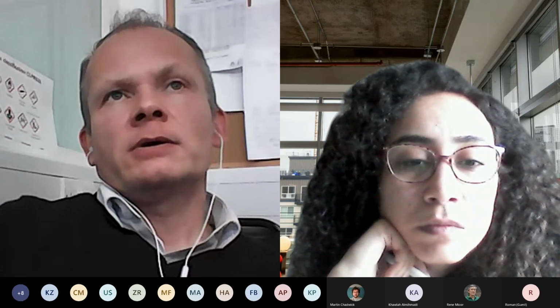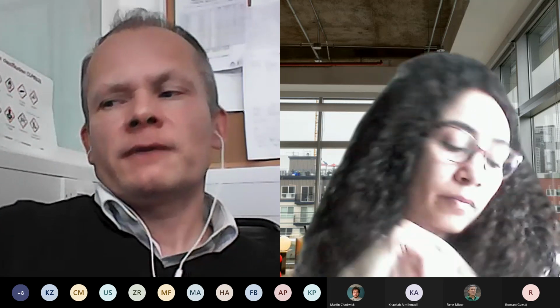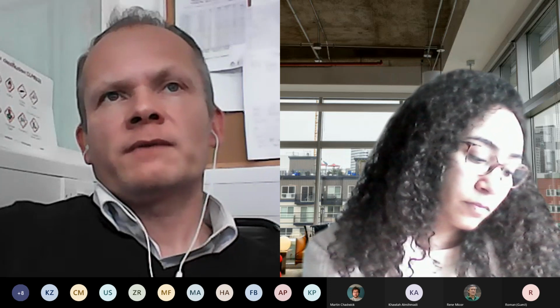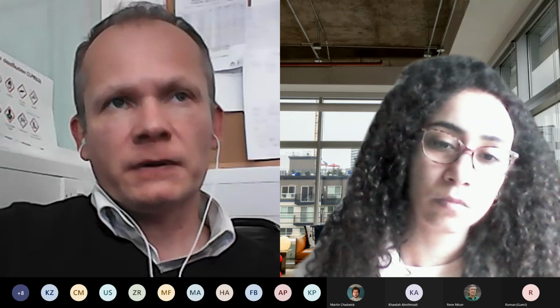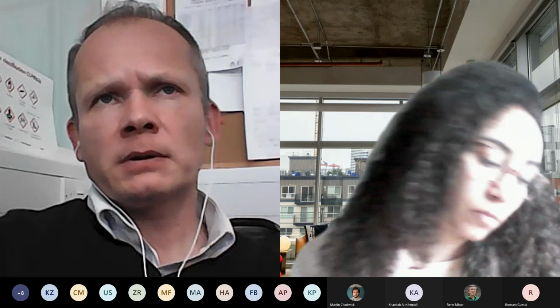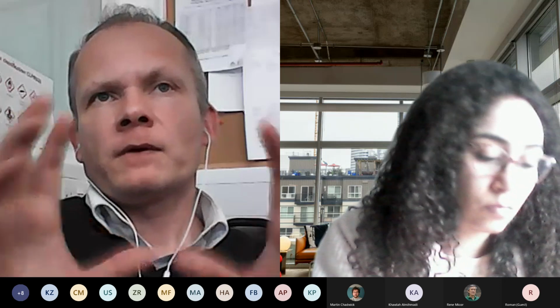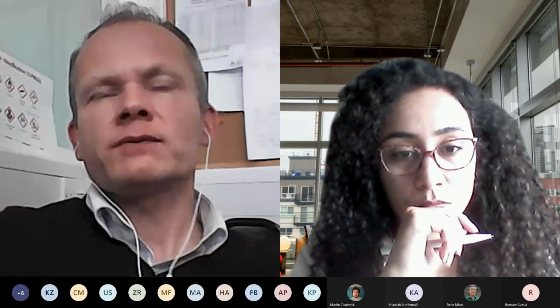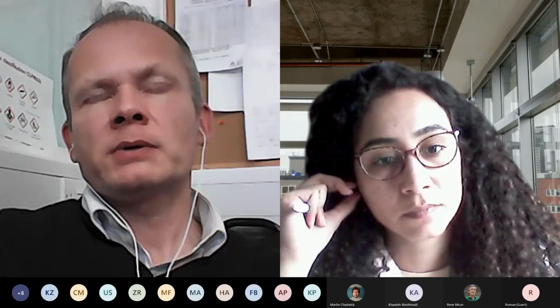I guess not. You can maybe try a Mastersizer. I think you need a Mastersizer, which is based on Fraunhofer diffraction. If you're familiar with this method, I think it's available somewhere in food and nutrition science. Instead of dynamic light scattering, you can measure the total scattering as a function of angle from the solution, and it works very well for large particles. So just write me an email, and I can provide you more information about Fraunhofer diffraction.